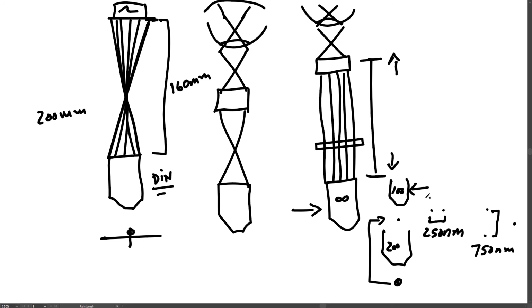I mean, there might be one or two out there for very specific reasons, but most microscopes have a 100x objective as their top magnification, and it could be a very inexpensive 100x, like $50 on a kid's microscope, or it could be $15,000 on a very sophisticated microscope. And the difference is the quality of the optics, the quality of the glass. So 100x is the highest power microscope objective.